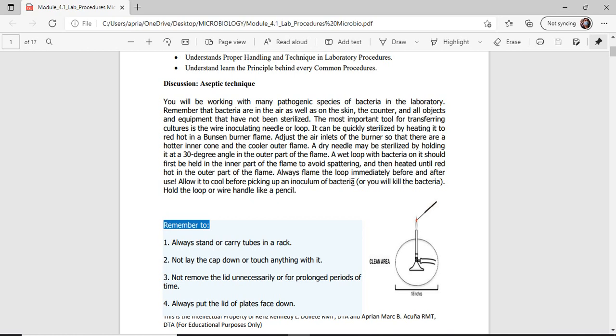Okay, after mo na inoculate or butang sang imong bacteria halin sa imong broth or sa imong ginkuhaan, which is a liquid, a broth, culture broth. Okay, so simply may basa-basa pa ng gamay. Okay, kung para sterilize mo, para mapatay ang ginsaylo mo na sa imong culture media, okay, ang magbutang ka sang imong loop, okay, sa inner nga flame.